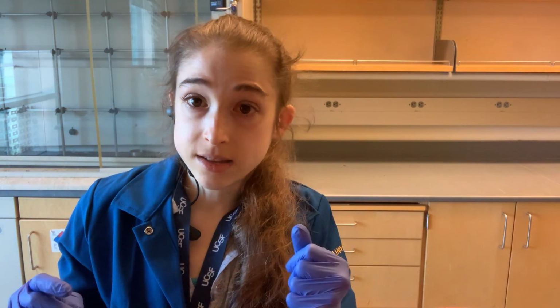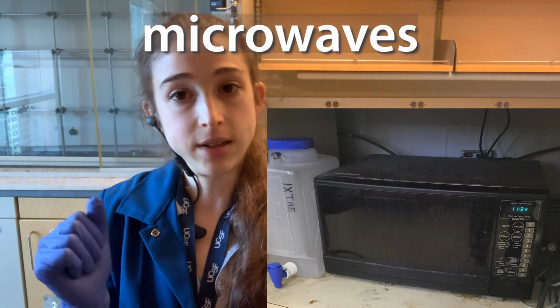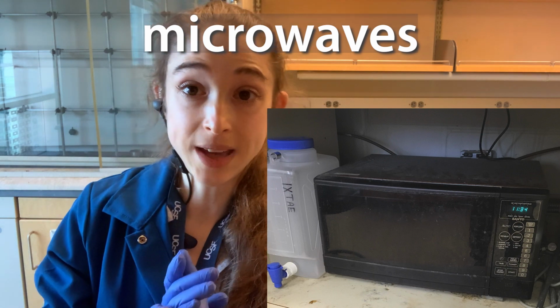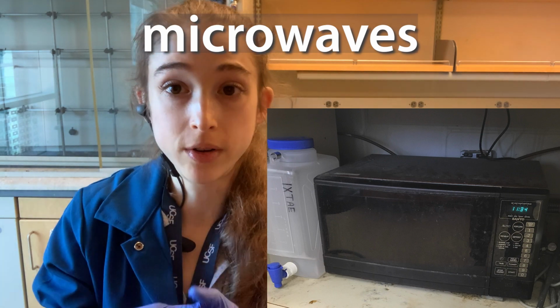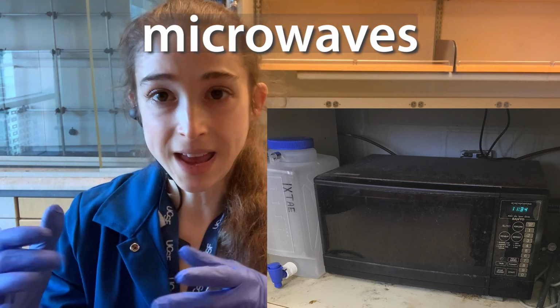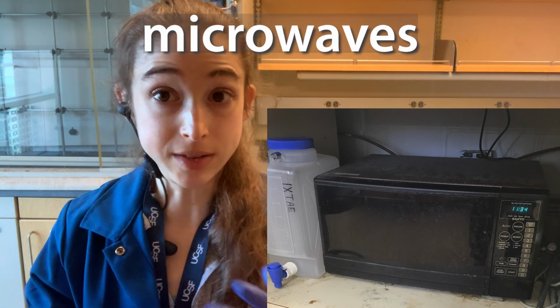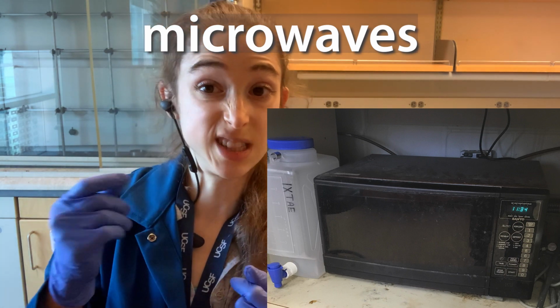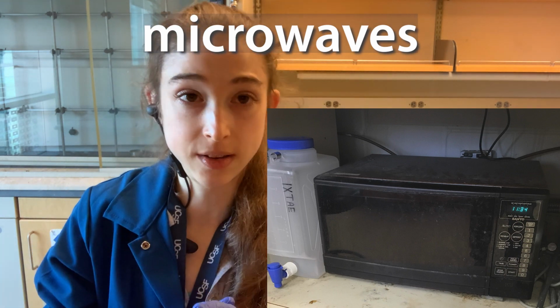Another way to get things hot is a microwave, and we often use the microwave when we're trying to melt the solidified LB agar, that gel that we're going to pour in our plates. If we made it ahead of time and now it's solidified, we can melt it back up and then pour it into the plates. So the microwave is helpful for this. It's also helpful if you're trying to do some sort of gel destaining, or speed up the process with a little short burst of the microwave.